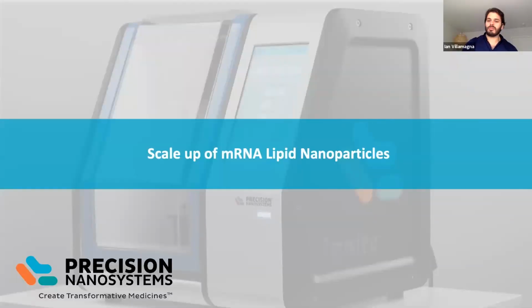All right. So we've talked a lot about liposomes, and I think this plays really well with that last question that we got. One of the other things I'd like to talk about quickly is a different type of construct that can be made on this platform, with scaling up in mind. And so here, what we're going to speak about is the scale up of an mRNA lipid nanoparticle.